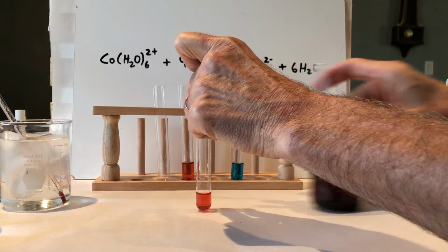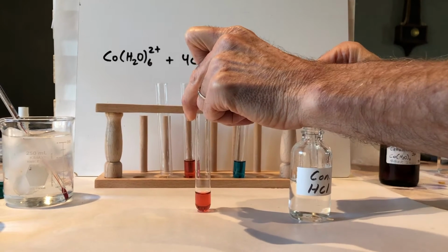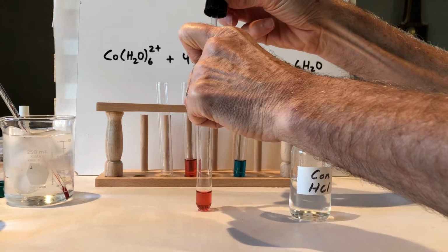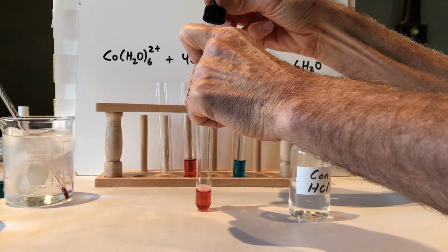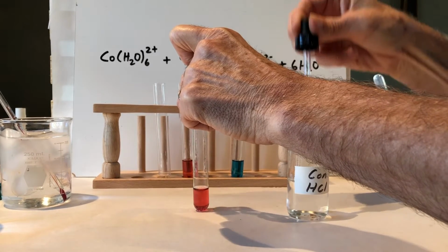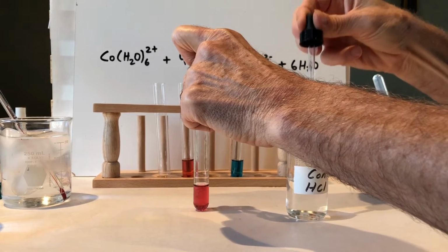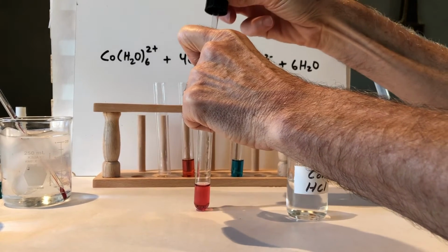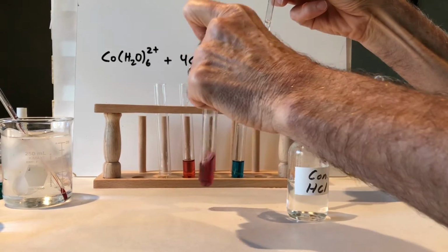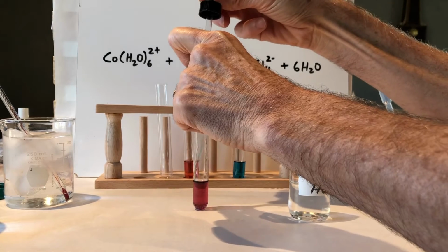So I now need to add some chloride ion from the concentrated hydrochloric acid. And I'm not going to really count drops. I just simply need to add enough to make the solution purple. So we're going to add until we get a fairly in-between purple color.